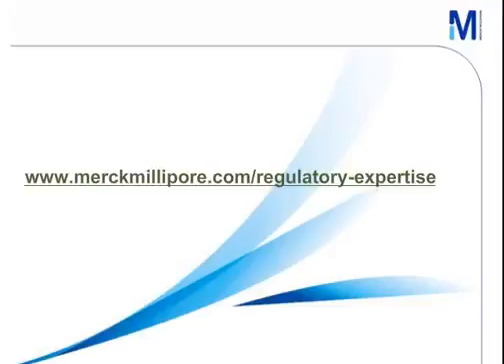What is the reference media? The reference media is mostly tryptic soy agar with the abbreviation TSA. The reference media may be different for specific microorganisms like Legionella. In this case, the reference media will be the Legionella specific medium without antibiotics. For every test in the Annex E and F, the reference media needed are mentioned and given there. Okay, thank you. Next question.